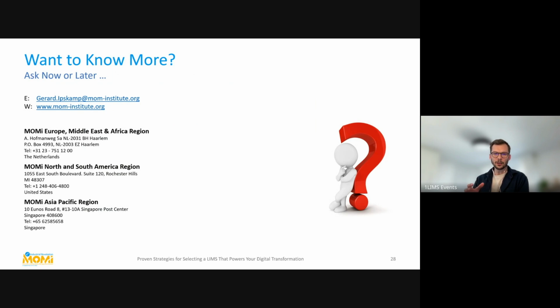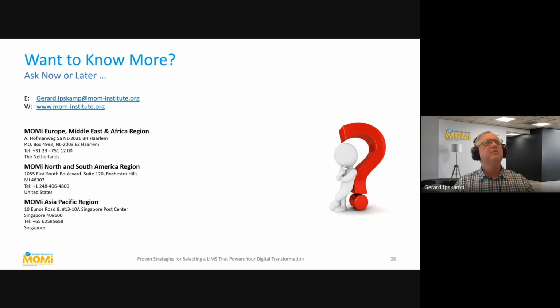Is there something similar if you want to move from paper and Excel to a LIMS, or want to move from an existing LIMS to another one? That's a good question. The same answer. If the maturity in paper and Excel is high, then it's the same as going from another system. But if your paper and Excel is also not so mature, we need more time to discuss what the to-be process is. So that's then the time-consuming activity as such.